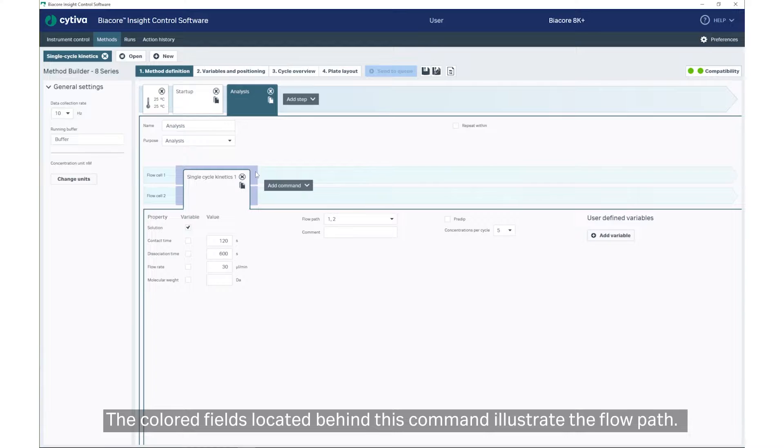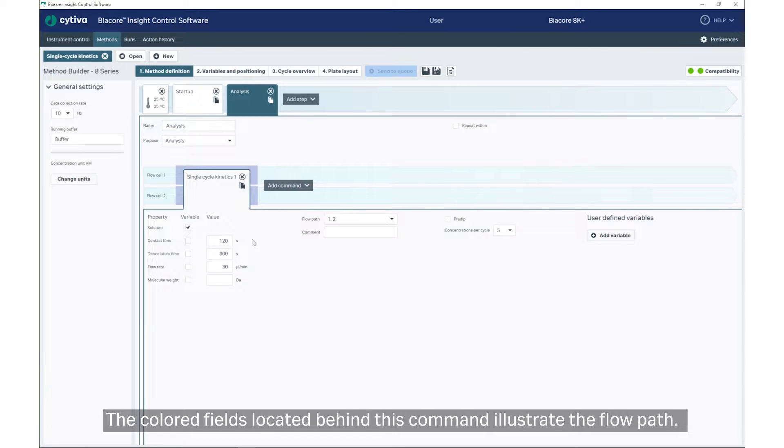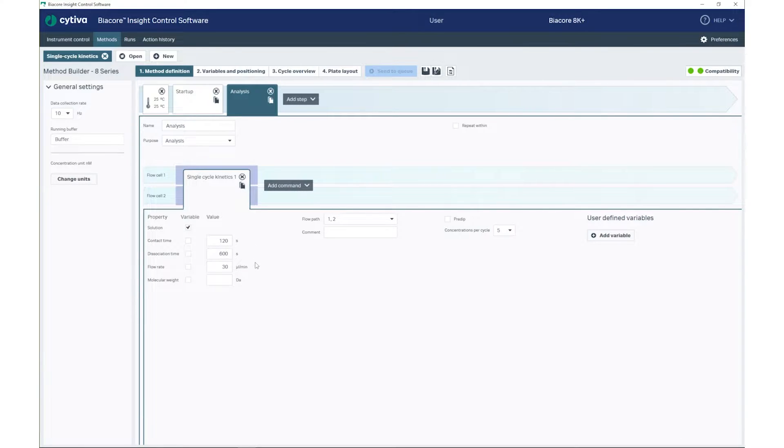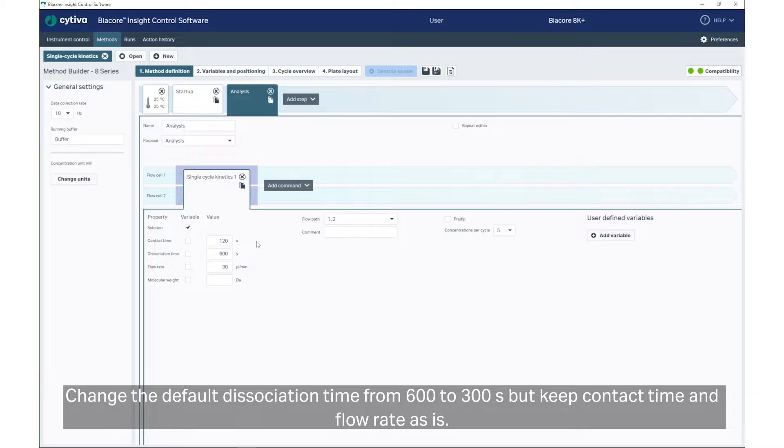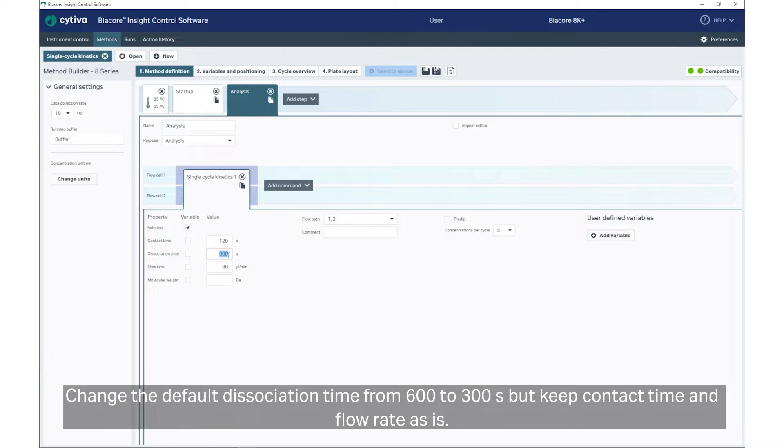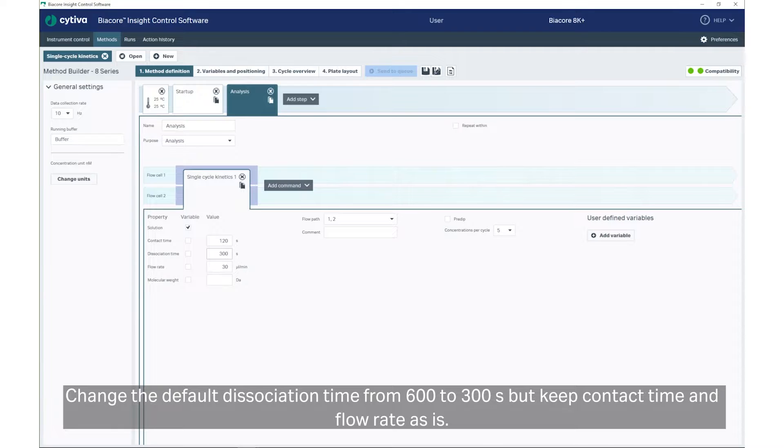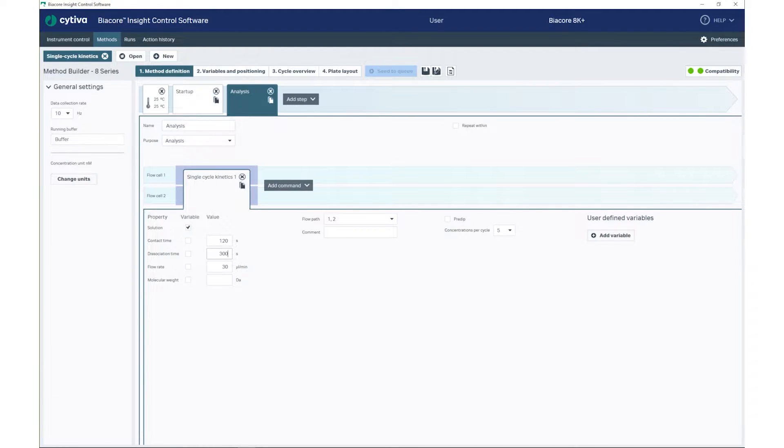The colored fields located behind this command illustrate the flow path. Review the settings in the Single Cycle Kinetics command. Change the default dissociation time from 600 to 300 seconds, but keep contact time and flow rate as is.